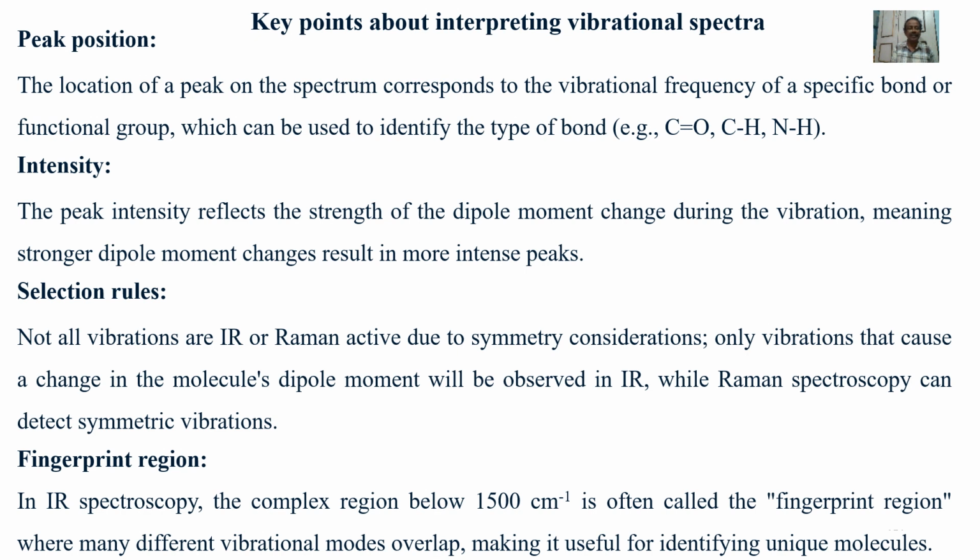Fingerprint region: in IR spectroscopy, the complex region below 1500 cm⁻¹, many different vibrational modes overlap, making it useful for identifying unique molecules.